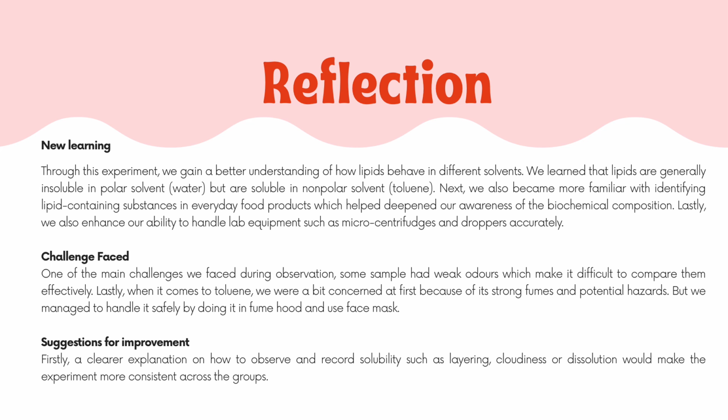Last but not least, suggestion for improvement. Firstly, a clearer explanation on how to observe and record solubility, such as layering, cloudiness, or dissolution, will make the experiment more consistent across the groups.